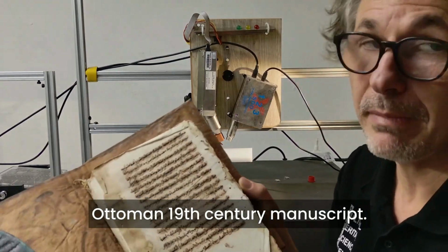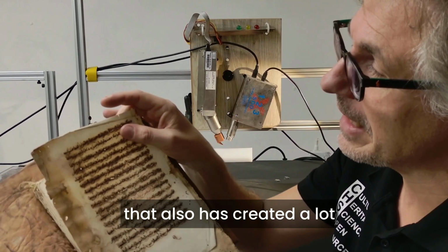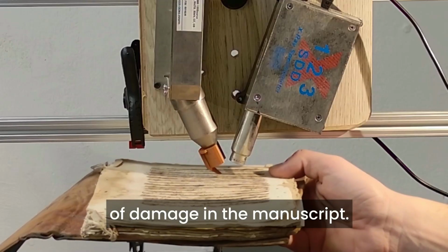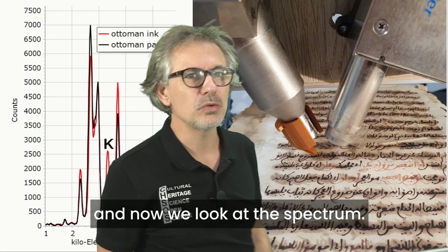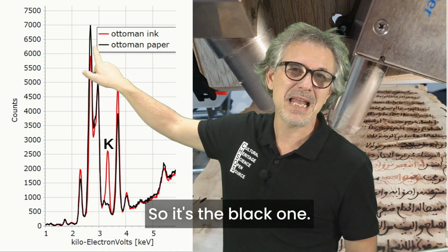Ottoman 19th century manuscript. Let's analyze this iron gall ink that also has created a lot of damage in the manuscript. So we did analyze this iron gall ink and now we look at the spectrum. I'm comparing the spectrum of the paper, so that is the black one.